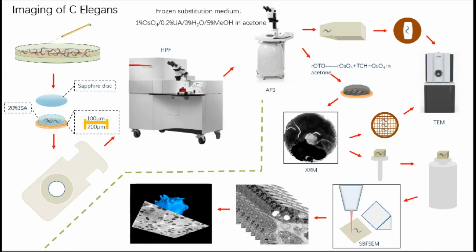All the resins are dissolved with acetone, and if it is not good to dissolve, we use the center fuge, and infiltration and embedding with EPON.